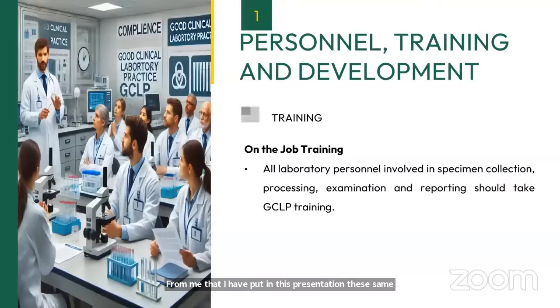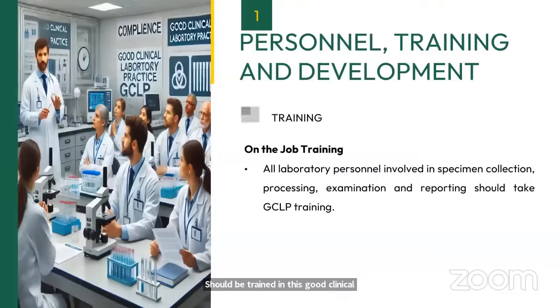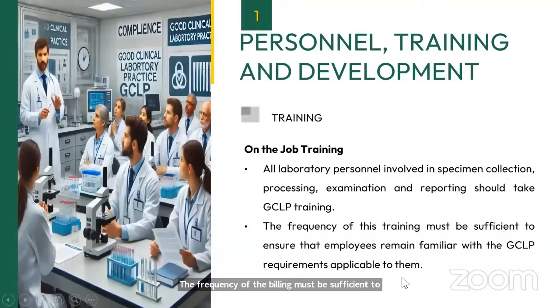So what it mentions is that all the personnel involved in specimen collection, processing, examination, and reporting should be trained in good clinical laboratory practices. It is mandatory to participate in this training program. The frequency of the training must be sufficient to ensure that employees remain familiar with the GCLP requirements applicable to them. Frequency of training is not like today I have taken one class, or this week I am taking a full class of 8 hours, and after 6 months or 1 year I have forgotten everything.